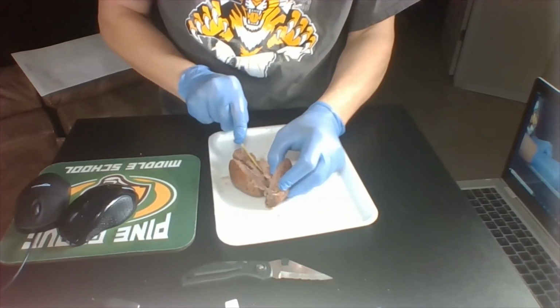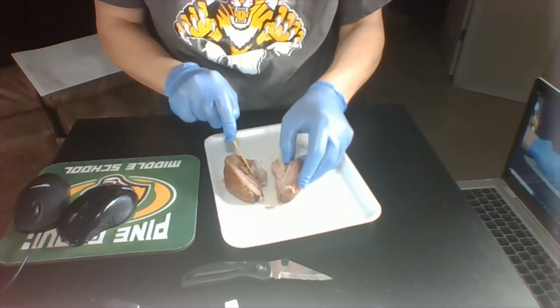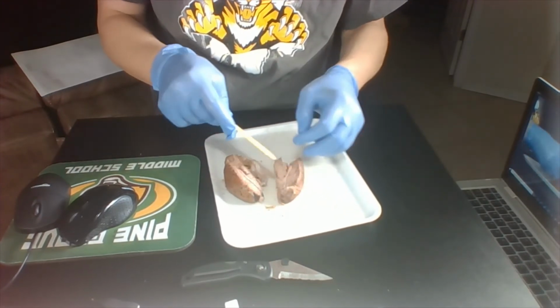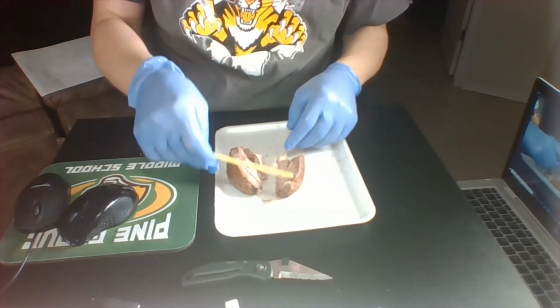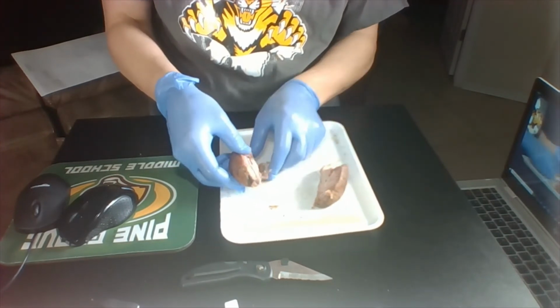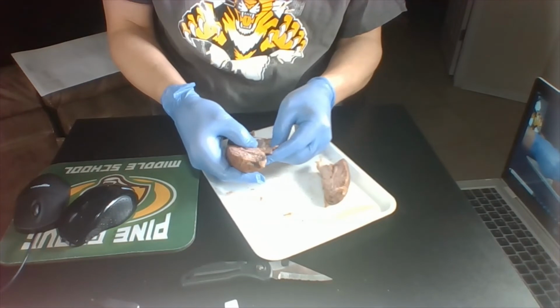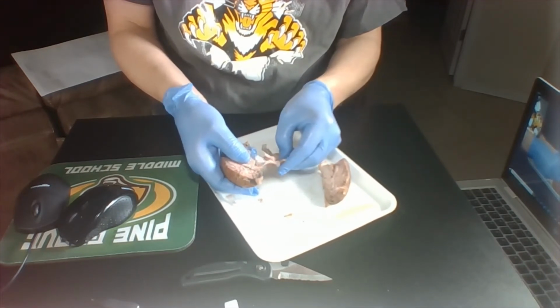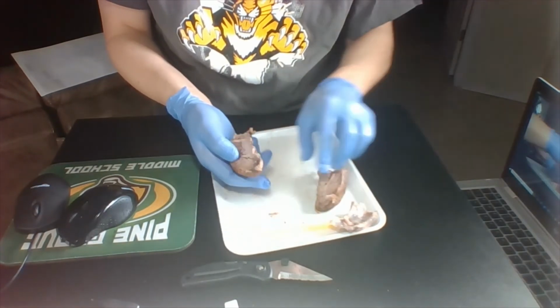And remember, we weren't going to identify the bottom. It's in the PLTW book if you're curious and want to know about where the parts are, and we've looked at it and identified it on quizzes. But like I said, we're not going to flag it or anything like that. All right, so let me see how this looks. So you can see now the cross section. I might just pull this part off for now because we're not going to do that bottom part for what we're doing today.